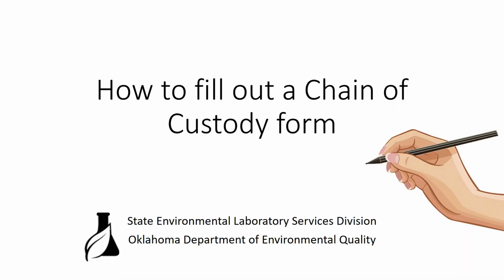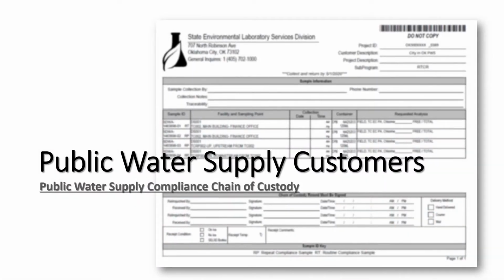Welcome to the training, How to Fill Out a Chain of Custody Form, brought to you by the State Environmental Laboratory Services Division. This training will describe how to complete a public water supply chain of custody for both compliance and non-compliance samples.